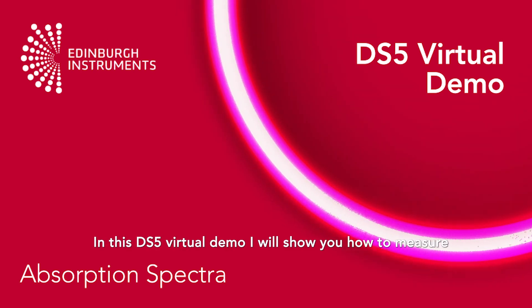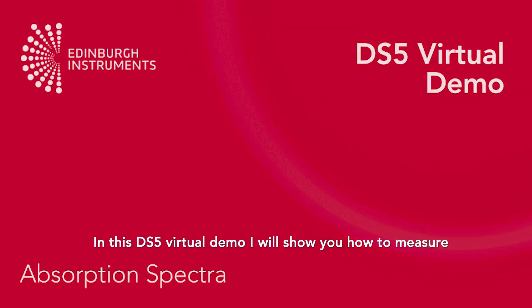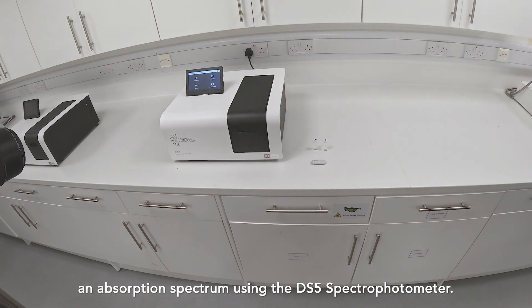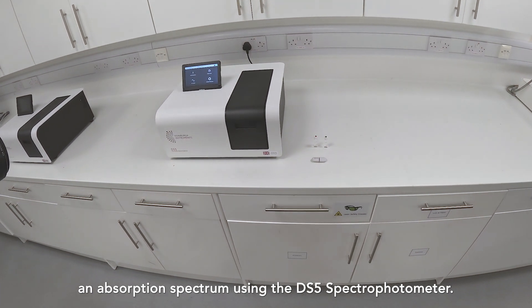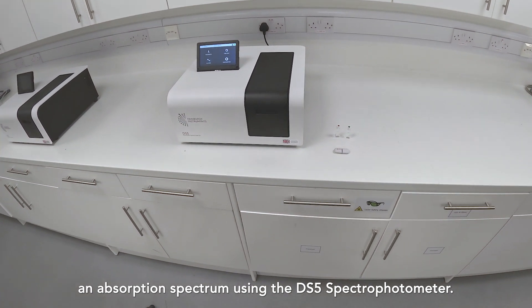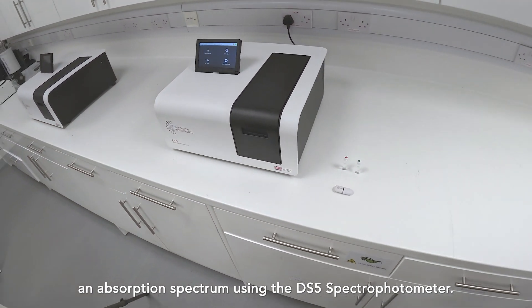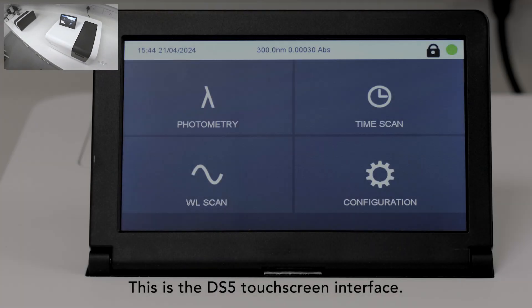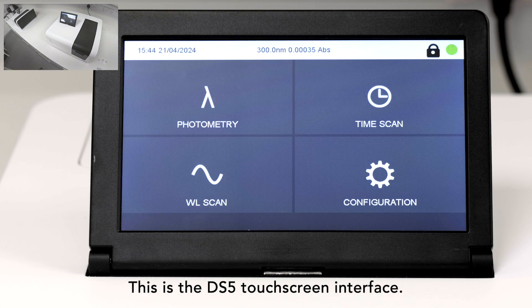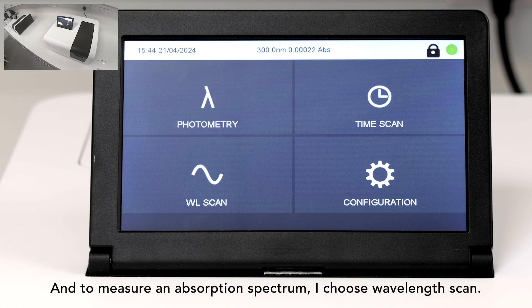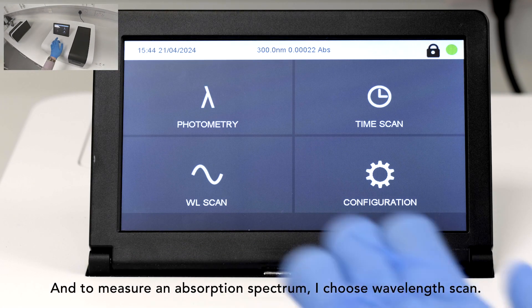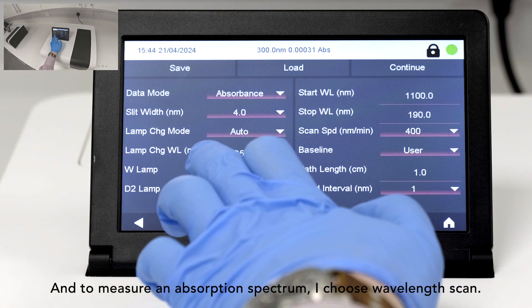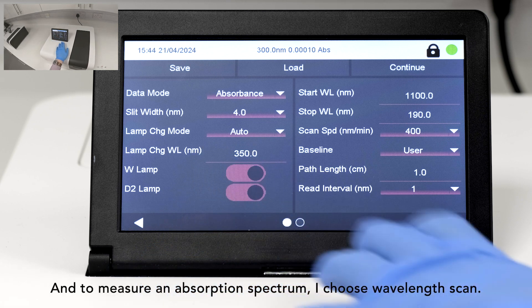In this DS5 virtual demo, I will show you how to measure an absorption spectrum using the DS5 spectrophotometer. This is the DS5 touchscreen interface, and to measure an absorption spectrum, I choose Wavelength Scan.